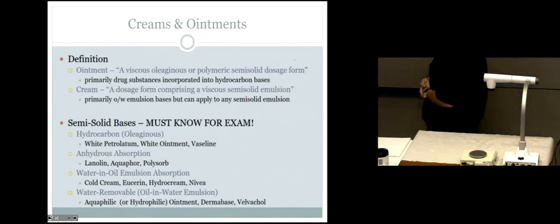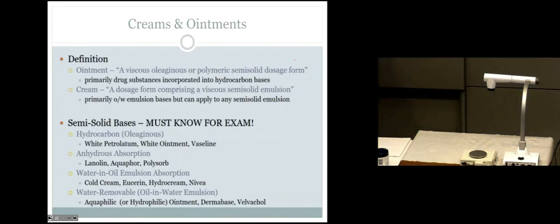So to be honest with you, from a compounding standpoint, we tend to use more of the anhydrous absorption bases than we do the oleaginous. They're just easier to be able to incorporate drugs and yet still have some of the same properties.